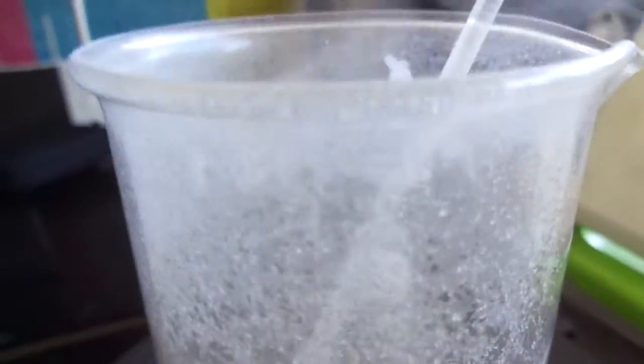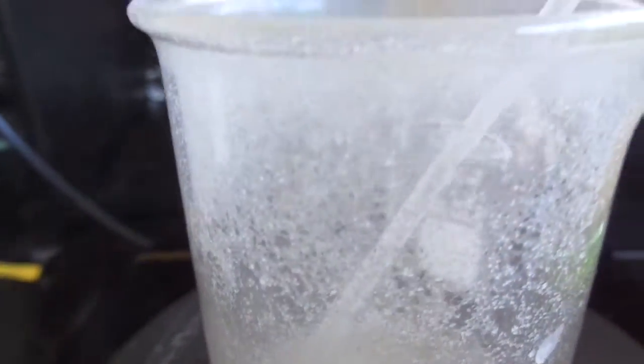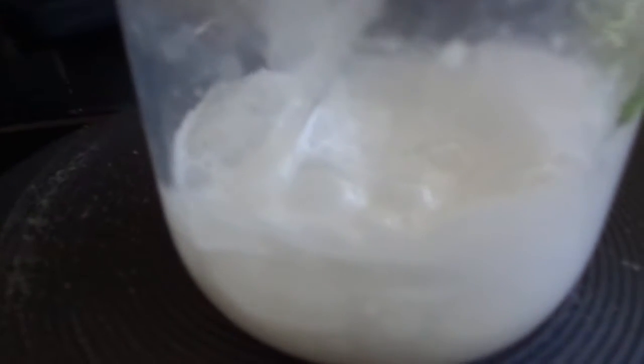There's also a bunch of stuff settling on the walls of the beaker which I'm not sure what it is — is it urea that's sublimating? Does urea even sublime? If you know, let me know in the comments. This really seems to be quite a bit of ammonia gas, so you need to be careful because it's toxic and irritating.